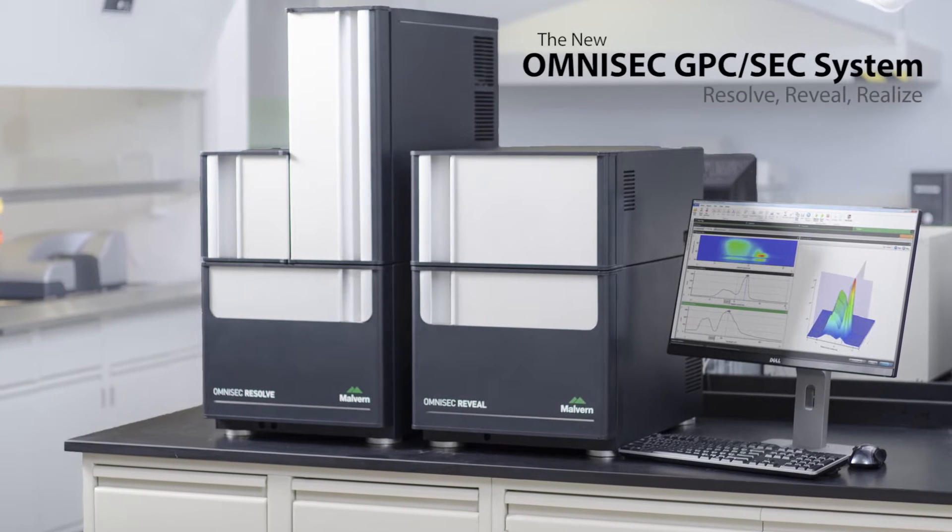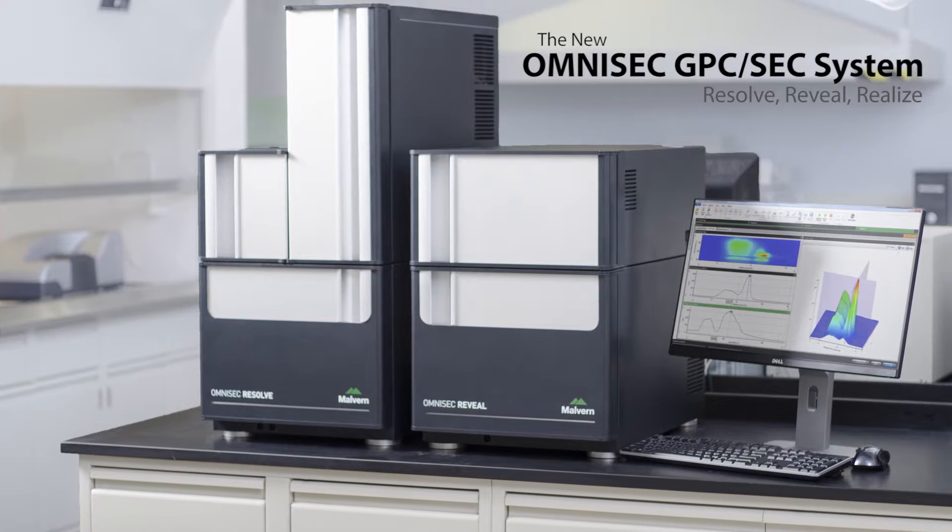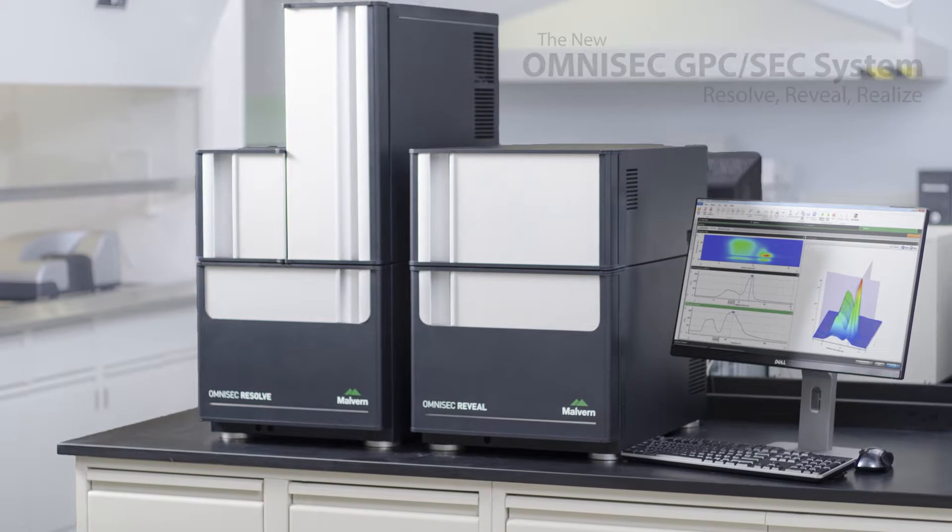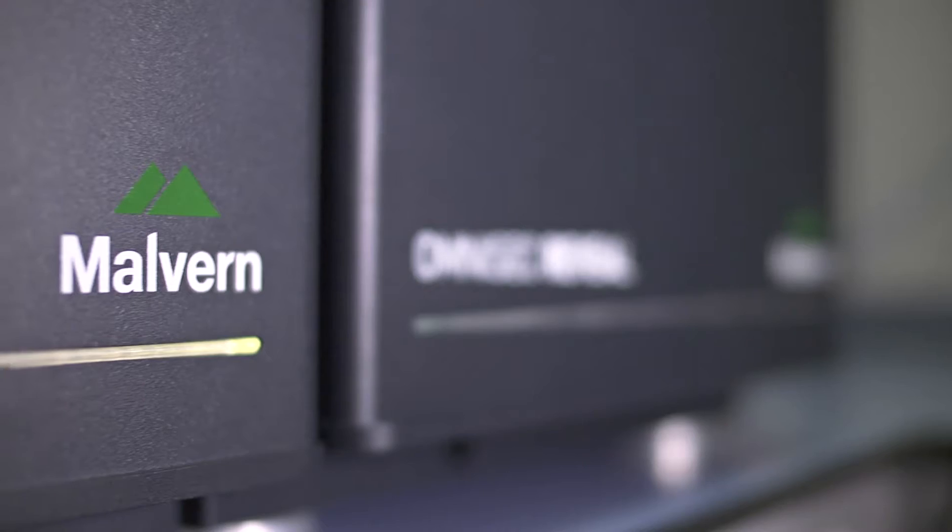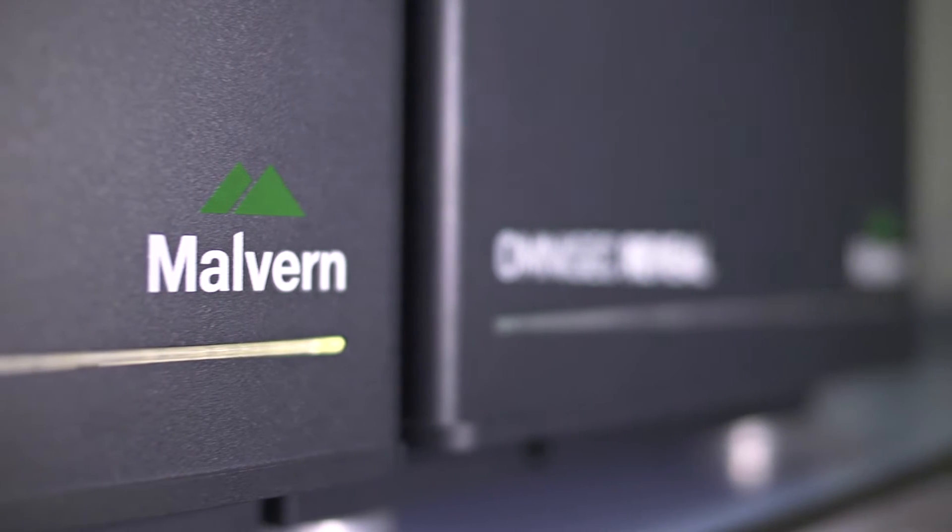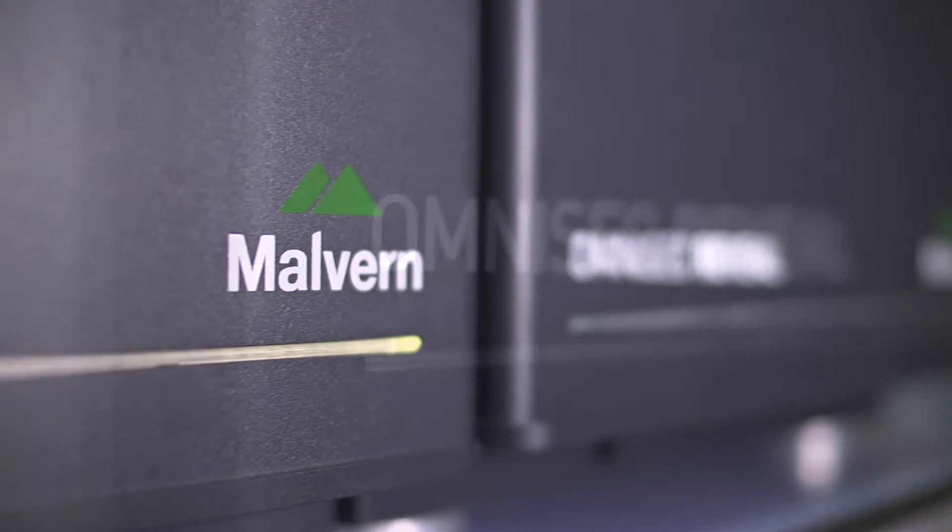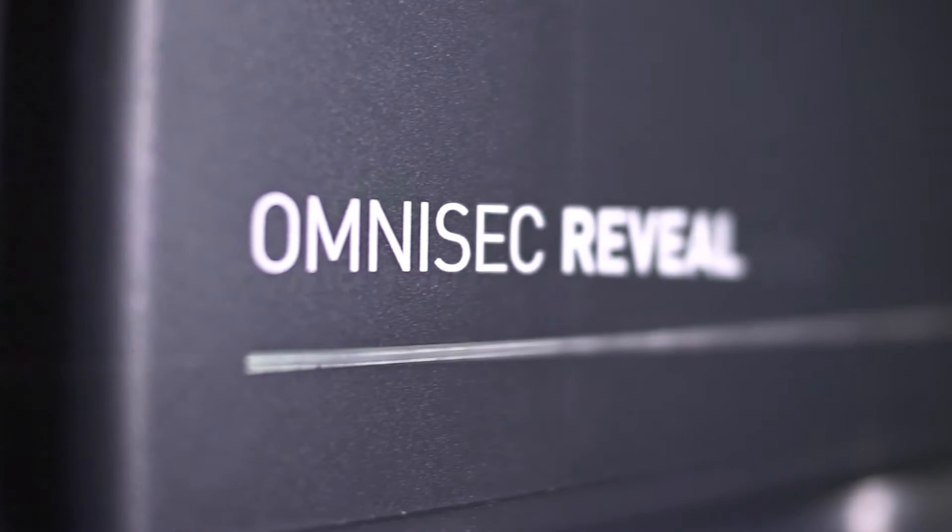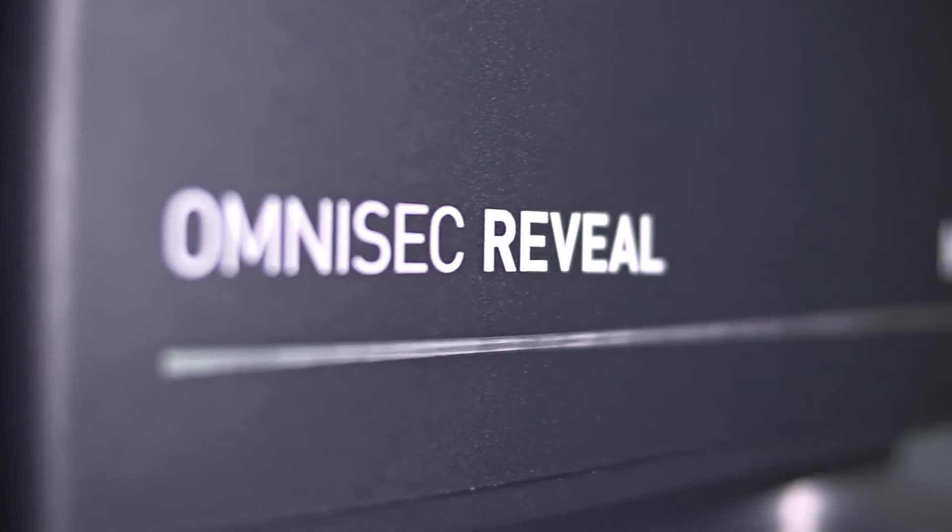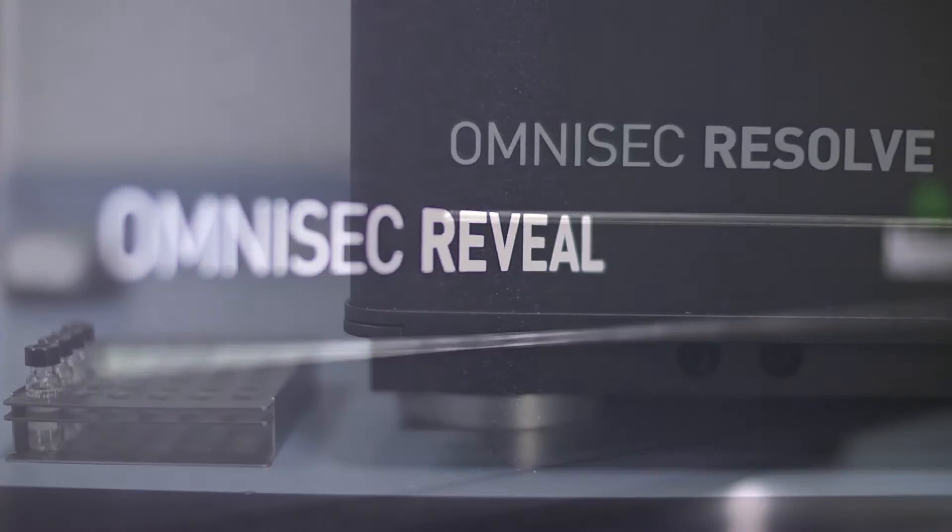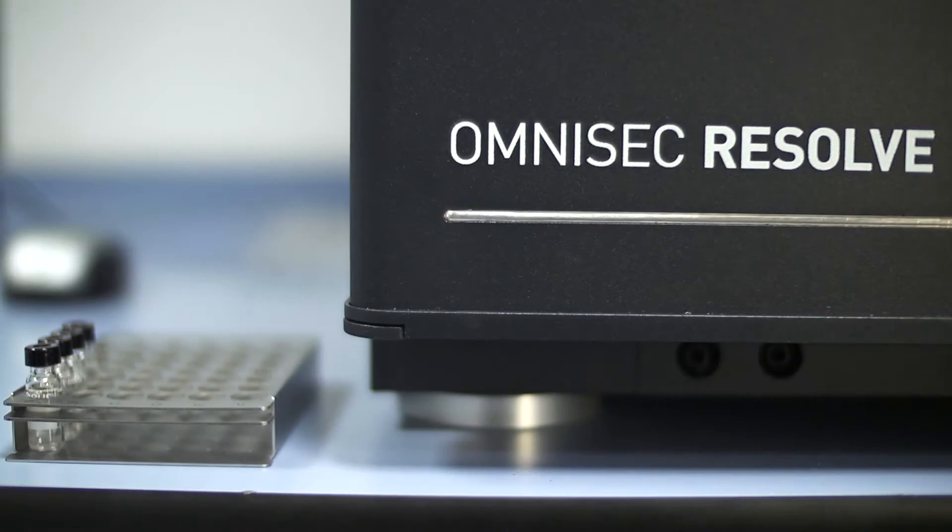Omnisec is the latest GPC system from Malvern Instruments. It's a completely new product developed using our 30 years of GPC and advanced detection experience.